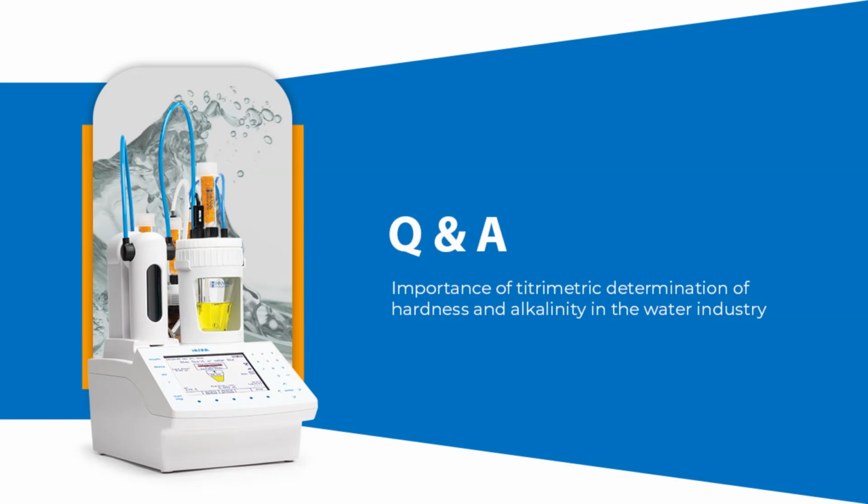Next question is by Suraj. Does this titrator help us analyze all the parameters required by PCBs, including TDS, COD, BOD? Yes, there are some methods which are pre-generated for the determination of COD, BOD. We can use the oxidation reduction titration for the determination of chemical oxygen demand. We can use potassium dichromate for the determination of COD, and the method is pre-established for the COD.